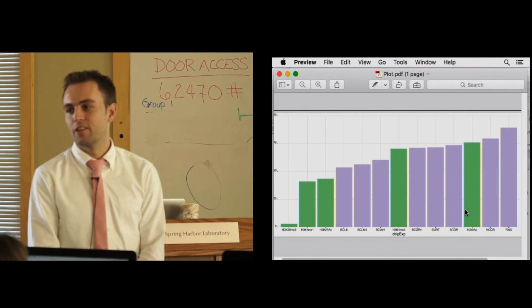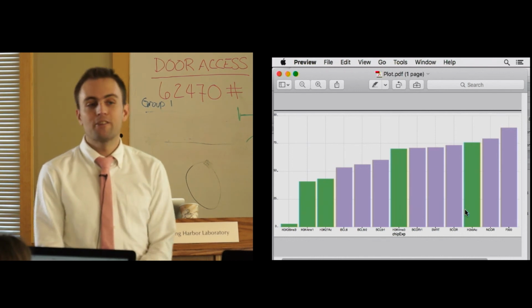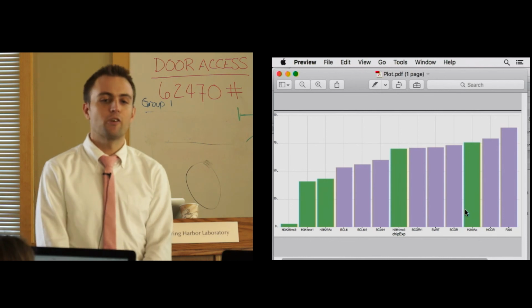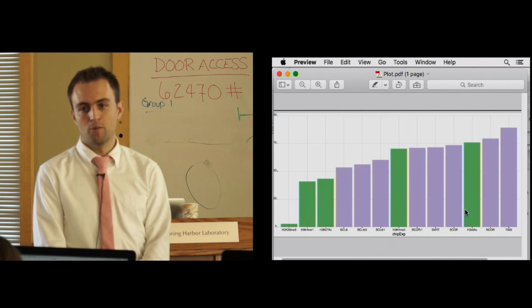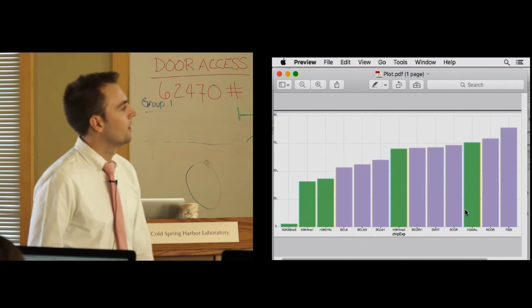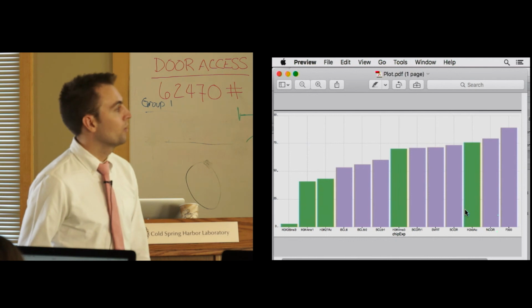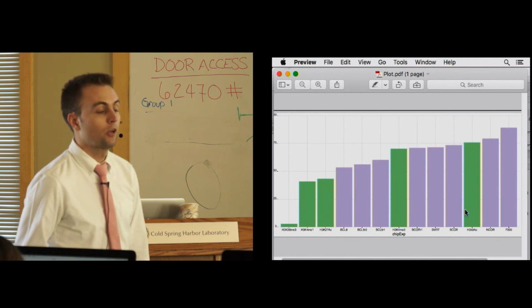So this is giving you sensitivity, but not really specificity. But assuming that our ATAC calls are fairly specific, which you could see if you looked more in the data, and could formally address too, the overlaps seem pretty strong.